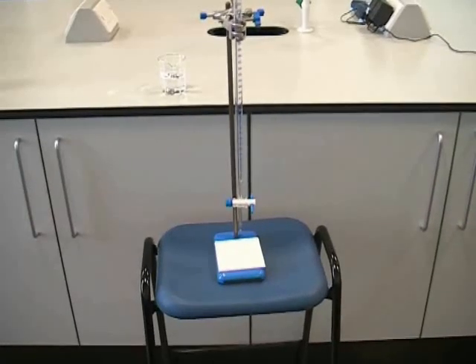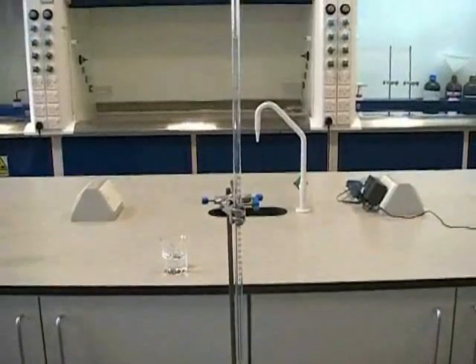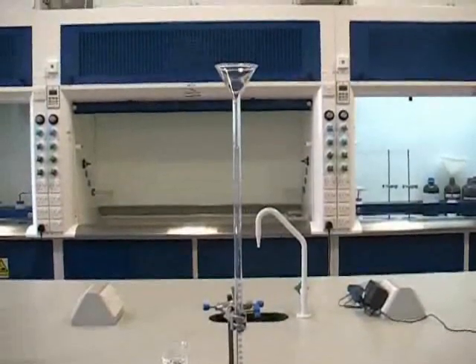One safe way of filling a burette is to clamp it and place the clamp stand on top of a stool. This allows you to look at the burette at eye level. You will be given guidance on what's expected of you at this point.